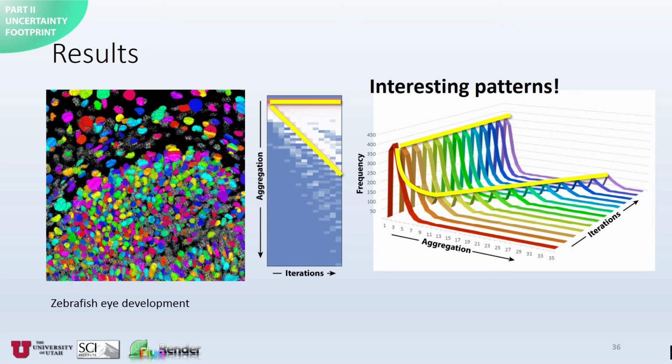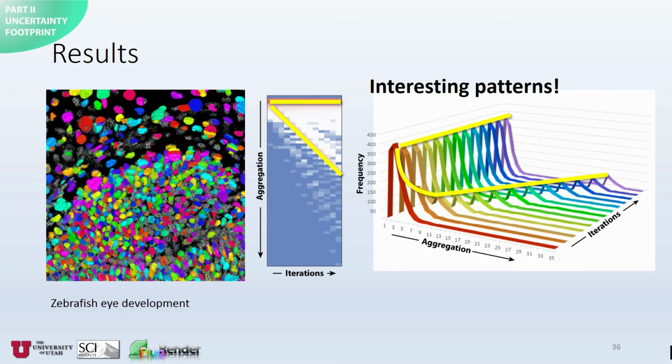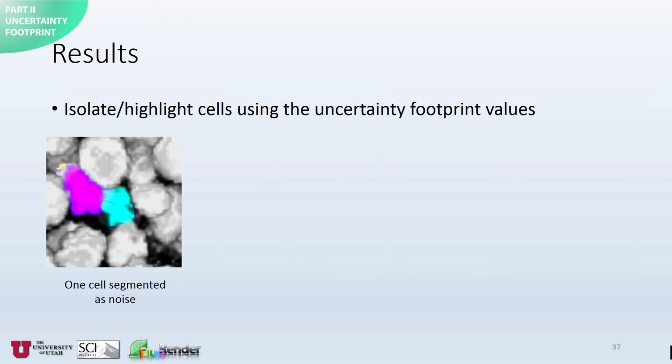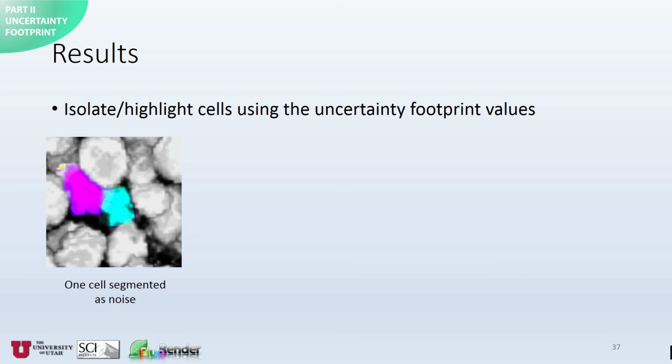in matching. We can also observe minor diagonal lines of different slopes from the histogram image. These are the tracking issues that we had hoped to detect. We can take a closer look at those tracking issues by isolating and highlighting the cells with many edge changes. Here are several examples. The first example identifies one cell that was segmented as noise in the first time point. The same cell was not able to get matched in the second time point. This conflict kept the cell matching results flipping.